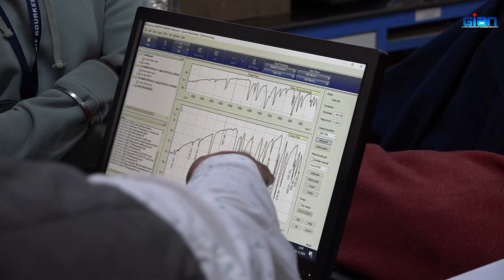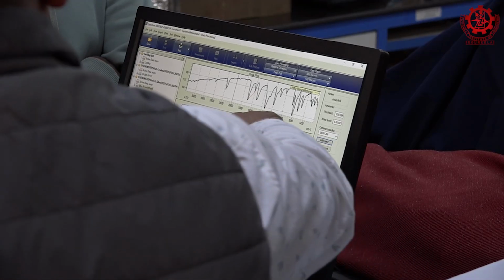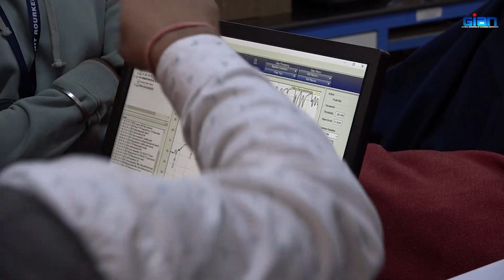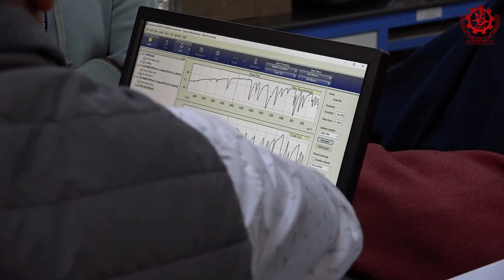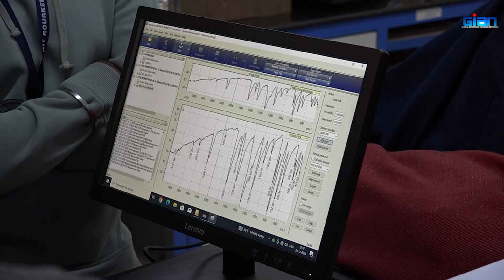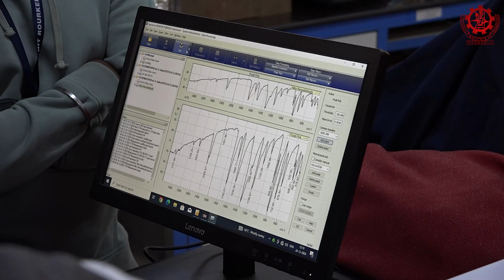Now again you can see all these peaks came, this is because of a technical error, nothing to worry about. It happens, there will always be technical errors, and this is definitely not a peak. You can see the peaks like this. Yes, there is a peak and these peaks are there. Again, you should be interested in the region after 1400. These are the regions which show what kind of functional groups you have. That is something we will discuss with the slides I have.